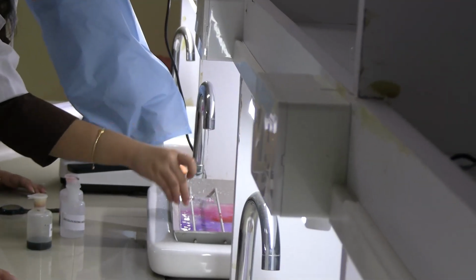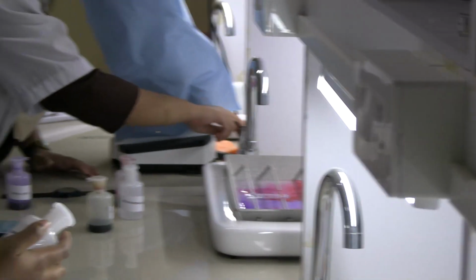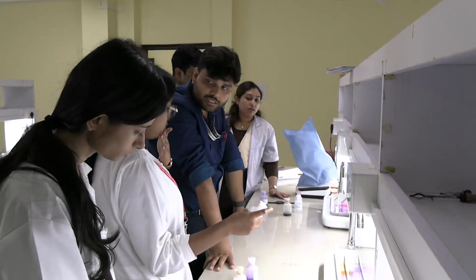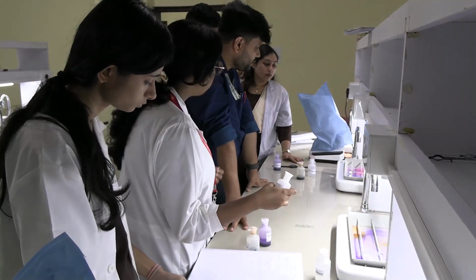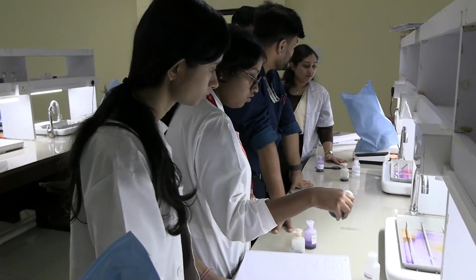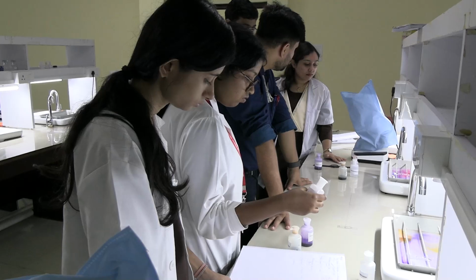Okay. Good. What is the final step? No. What is the final step? Final step is called counterstaining. So we're gonna put the safranin there for 30 seconds. What is the other dye that we can also use?